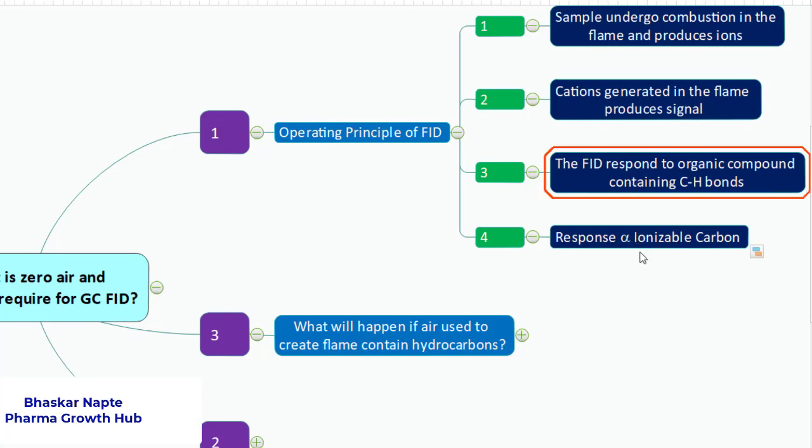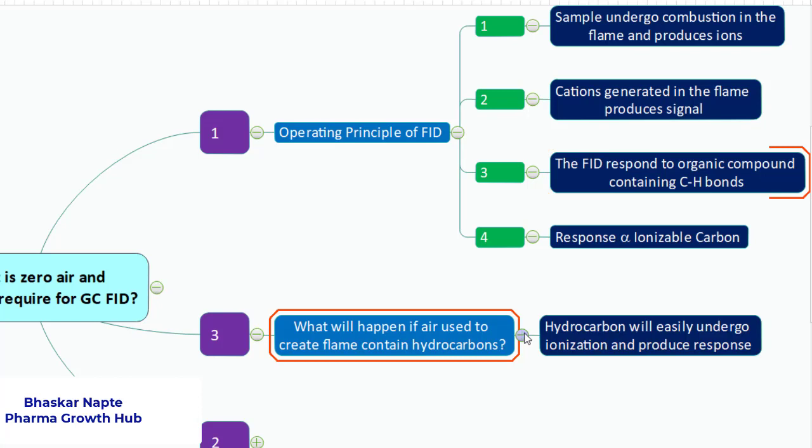If you understand clearly according to point number three - what is point number three? FID responds to organic compounds containing carbon and hydrogen bonds, means the organic compounds which are hydrocarbons give very good response to the FID detector. So if your air contains hydrocarbons, what is going to happen?